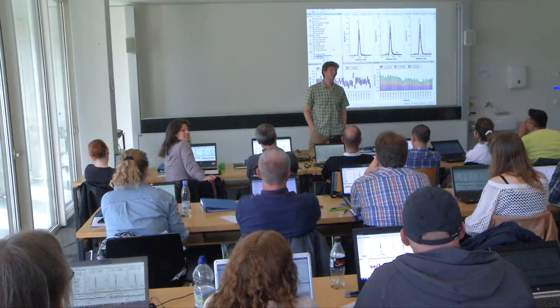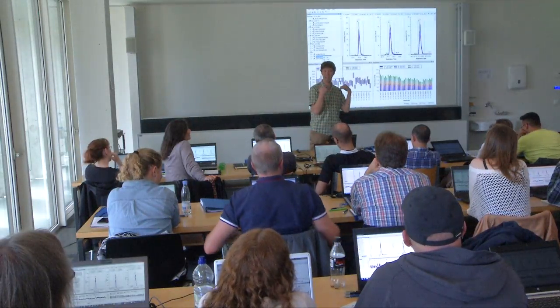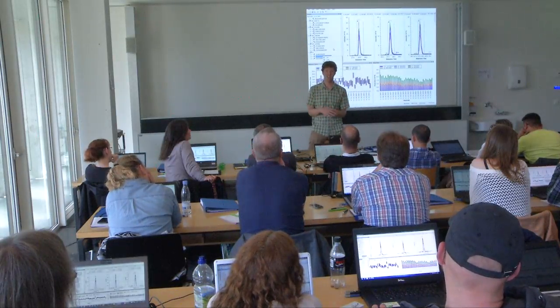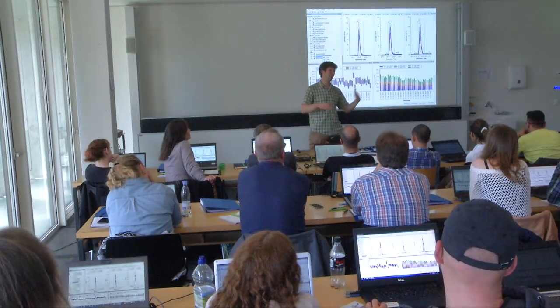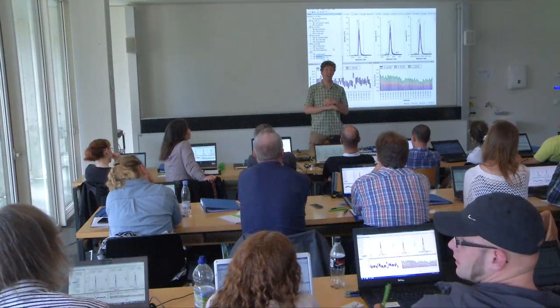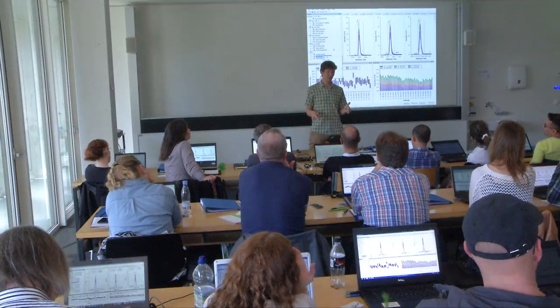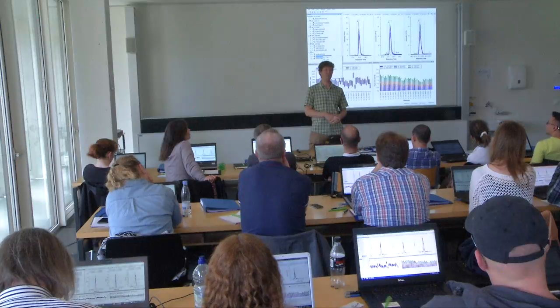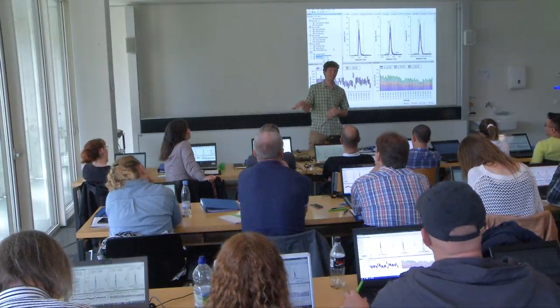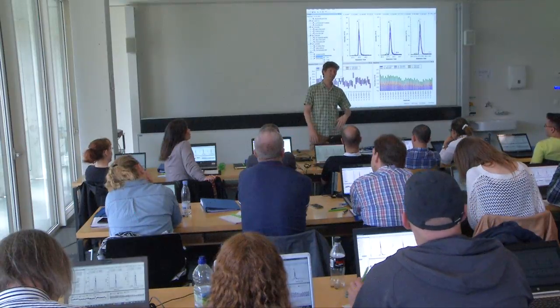Too few peptides? Well, what do we expect of these peptides? They come from the literature. In this case, we're expecting them all to change, right? So when we normalize to total ion current or to the median peptide or something like that, we're assuming that the vast majority of our data is unchanging. Whereas in this case, the whole point of this experiment is we hope that absolutely everything is changing. So if we adopt normalization strategies from DDA, we might actually normalize away our entire effect, and then we'd be like, oh, nothing changed.